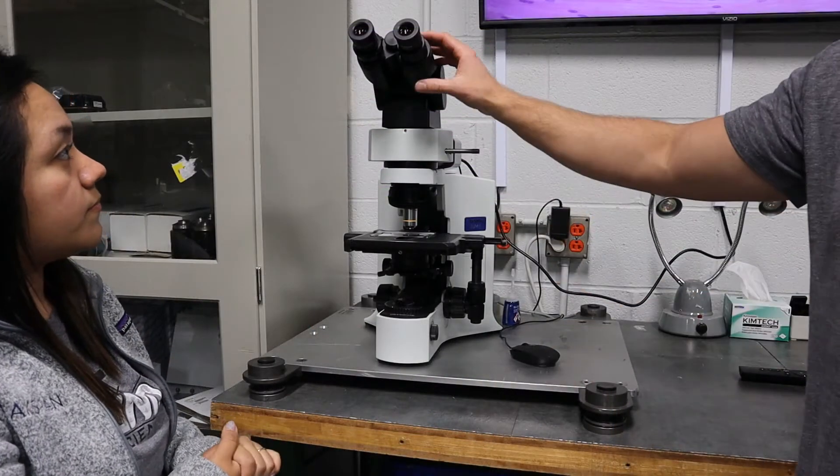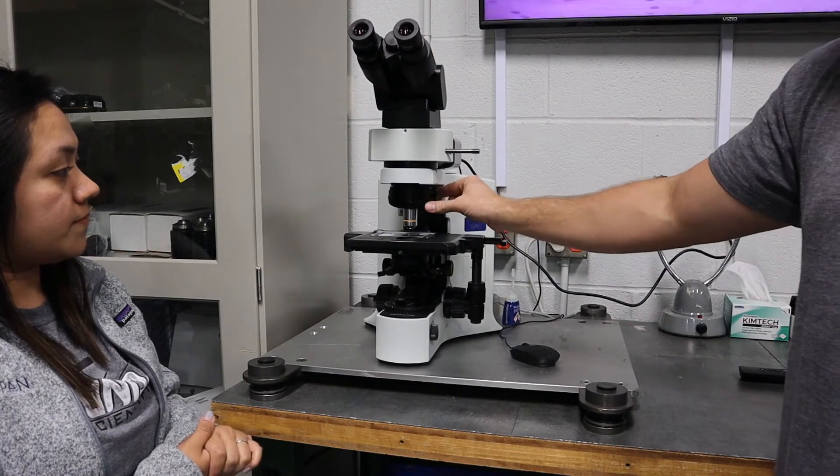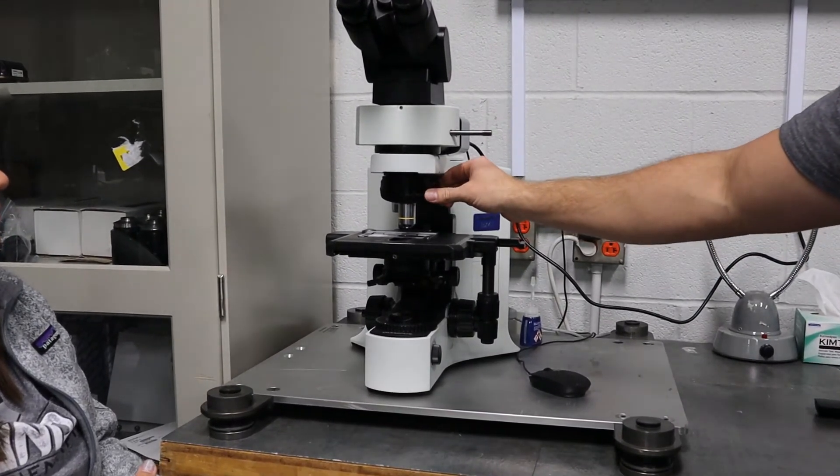First you want to make sure your eyepieces are in focus and the microscope is in focus. Then you want to make sure the 10x objective — it's usually yellow on most microscopes — is in the field of view.